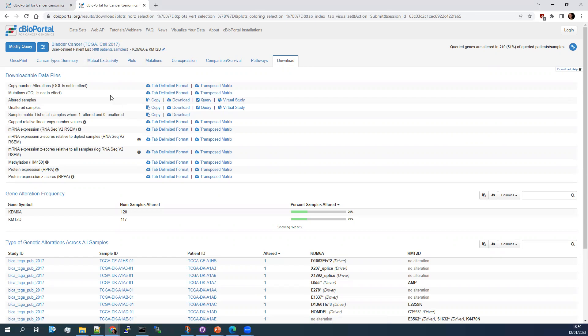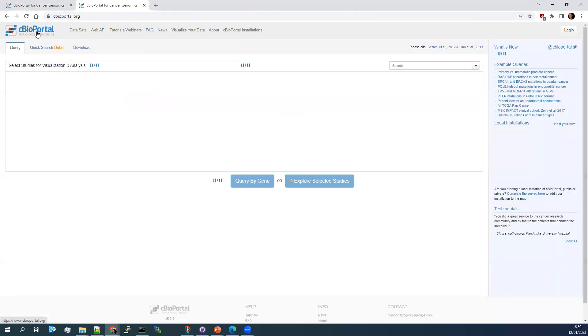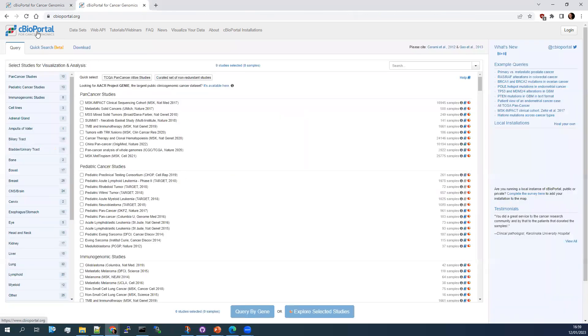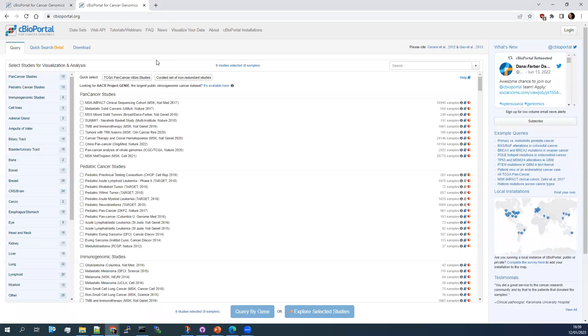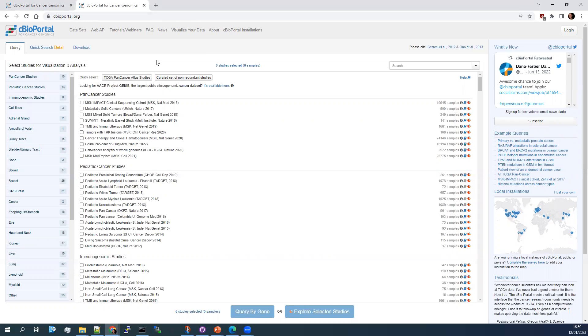So that takes us through the walkthrough. One thing I would always suggest is that once you've got lots and lots of filters applied to a dataset, rather than trying to individually take them off and you're not entirely sure what order things have been filtered in, I would always return to the homepage. Okay, thank you very much.